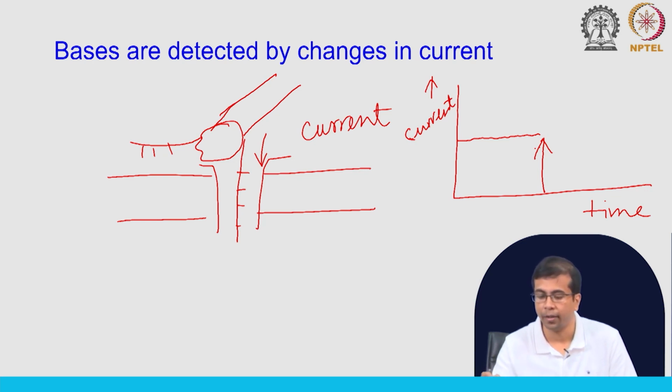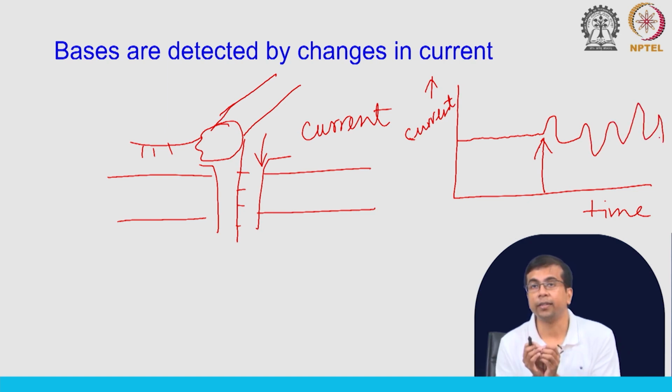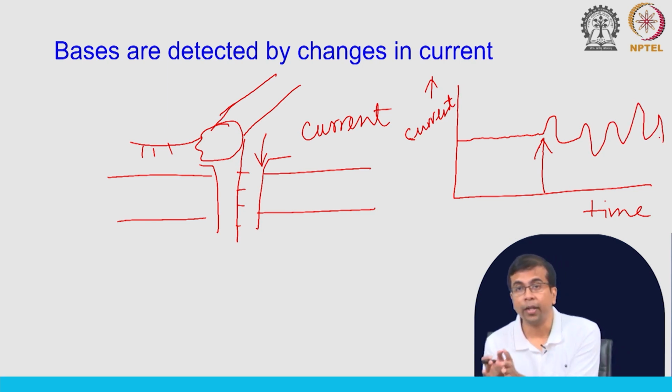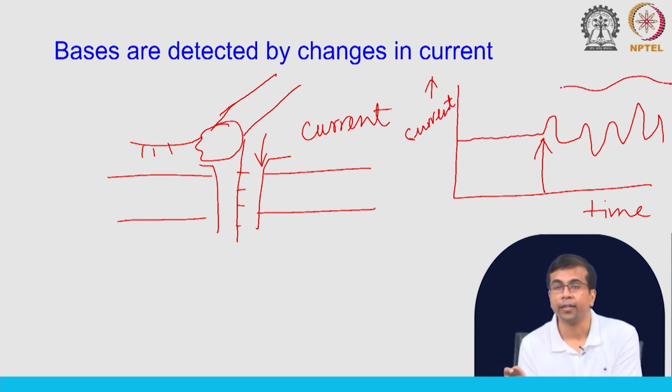So, what will happen is that because of these specific sequences, they will modulate or change the current, and we will start seeing this kind of peaks, valleys, some sort of change. Again, this change is dependent on the sequence. So, by looking at the change in current here, what kind of change we are seeing, we can then identify what are the bases that are passing through the nanopore.